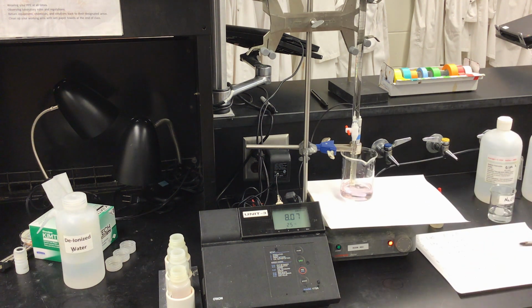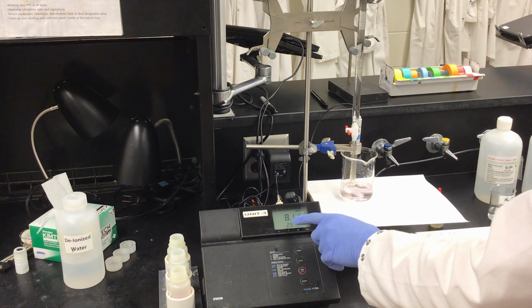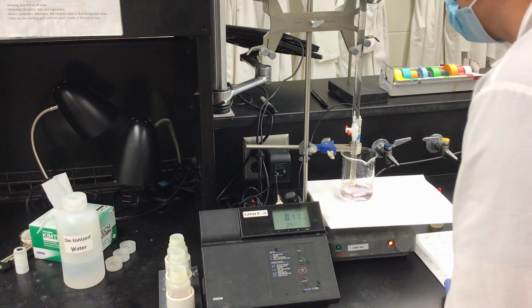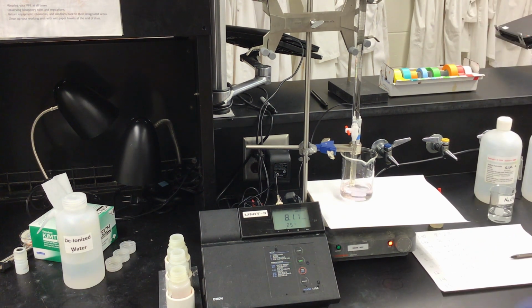And as I look, my solution is a very light pink. It may be a little hard to see, but this is our endpoint. We do not want to go beyond this, since it will turn very dark pink and show that we have gone too far past. As you can see, our pH meter is reading a pH of 8.11 with a final volume of 25.2 milliliters. We will wait 20 seconds to see if our pink indicator goes away.